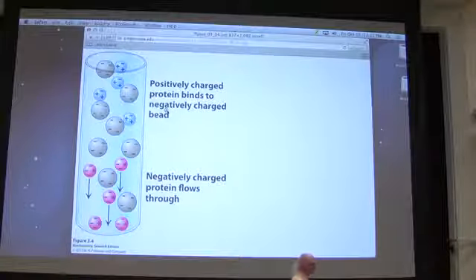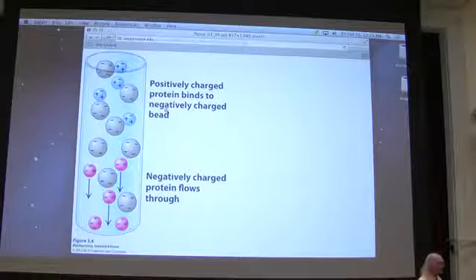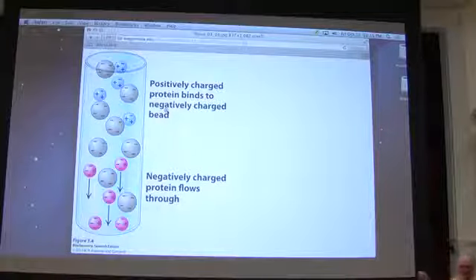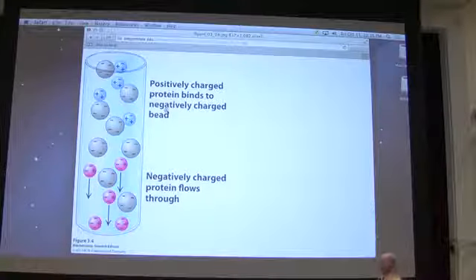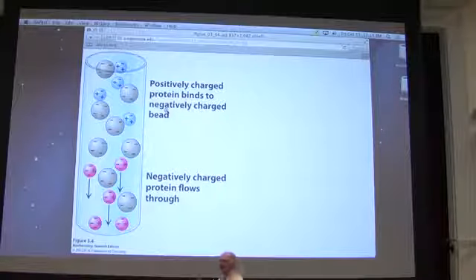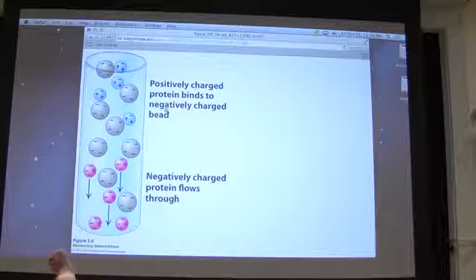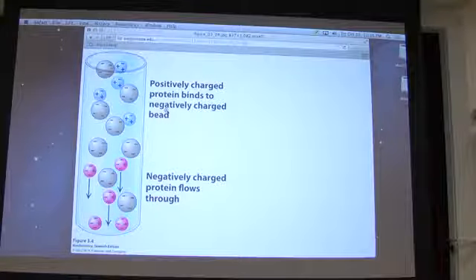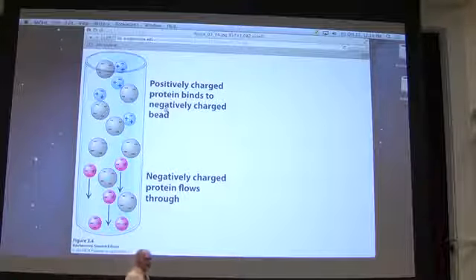When I apply my mixture of proteins to this, some proteins are going to have a positive charge, some are going to have a negative charge, and some are going to have a 0 charge, right? Well, if I have a positively charged protein, that protein can exchange with the counter ion. That is, it can replace a sodium or a potassium, and then that positively charged protein is going to stick to the bead. So the exchange is the critical thing.